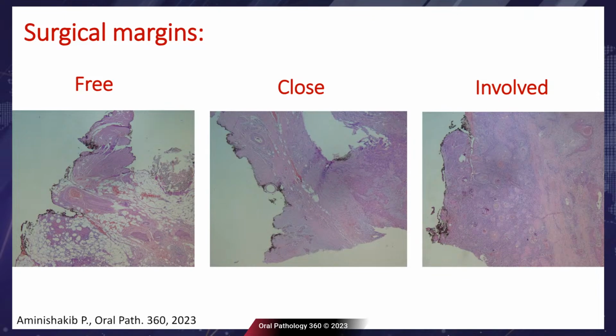You can see here that surgical margins could be well marked by ink. In the left-hand side photo, you can see that there is no tumor, and the surgical margin is completely free.